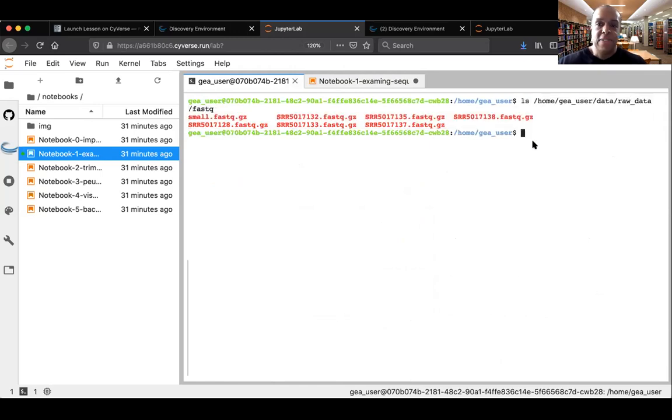So once you do things in the Jupyter Notebook, you may want to go ahead and do things at the command line. One little tip is nobody really remembers every single command. Copying and pasting is really something we do quite frequently when we're doing bioinformatics. So don't be afraid to copy and paste, but some of them certainly you'll get a hang of and remember how to do them.